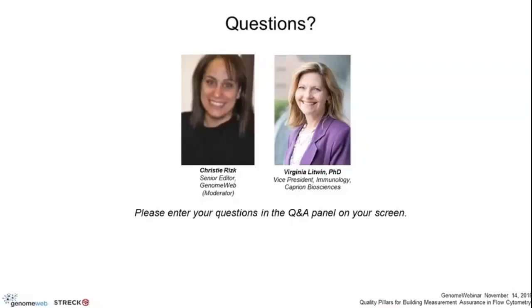And what would you say is an acceptable percent change in reagent lot-to-lot evaluation? Okay. In the validation webinar that I talked about, I made the point that, in my opinion, within assay precision is the most important thing. It's really important to validate that. You need to understand, when I take a sample and run it 3 times in an assay, are my CVs 2% or are they 20%? If my inherent variability is 20%, when I look at lot-to-lot or stability, I need to keep that in mind.